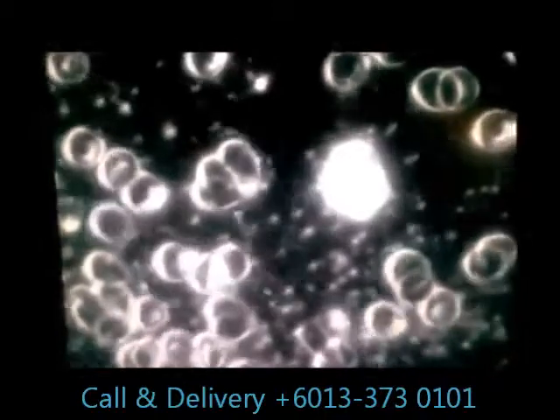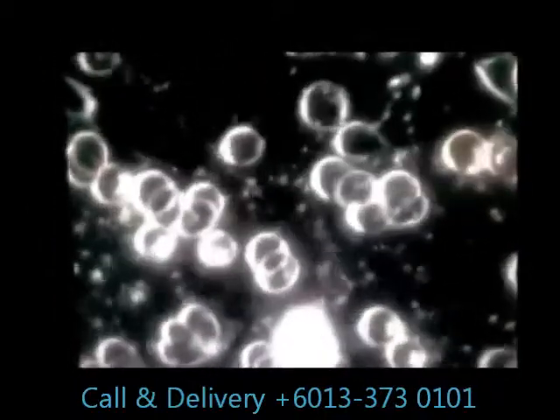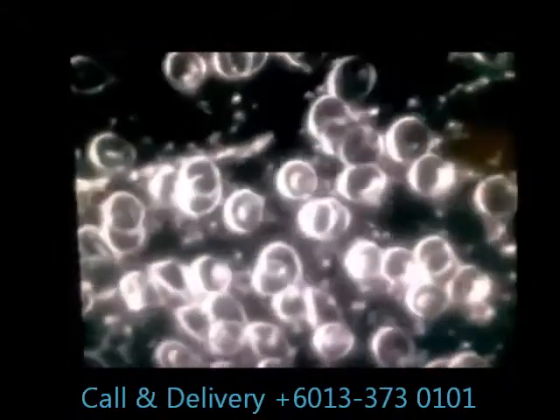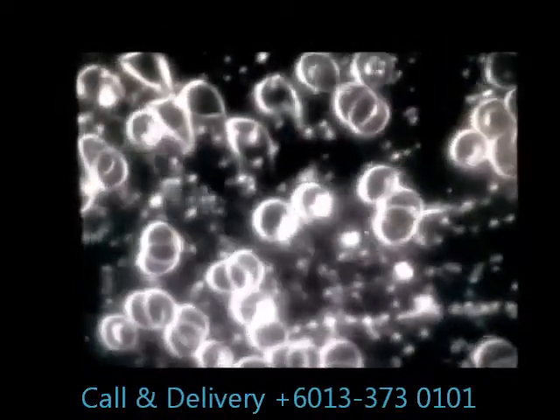The shininess inside the red blood cells, the bubbles, lets me know that they're not actually getting the oxygen and nutrients throughout the body, because that's the function of the red blood cells, is to carry the oxygen and nutrients throughout the body. There's a lot of trash in the blood plasma, which is the background of the blood.